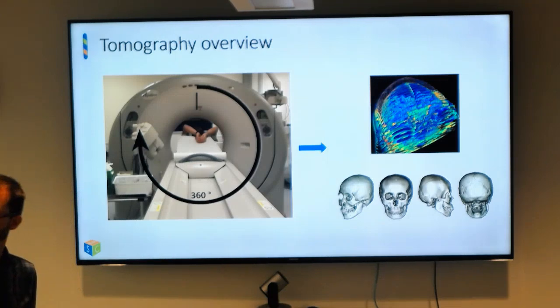Okay, quick question. Do you measure those curves yourself, or is this something given to you by the camera manufacturer? You measure them yourself by putting in a beam stop. You need a sharp straight edge, a knife edge right at the sensor. Yeah, it's a measurement you can do.